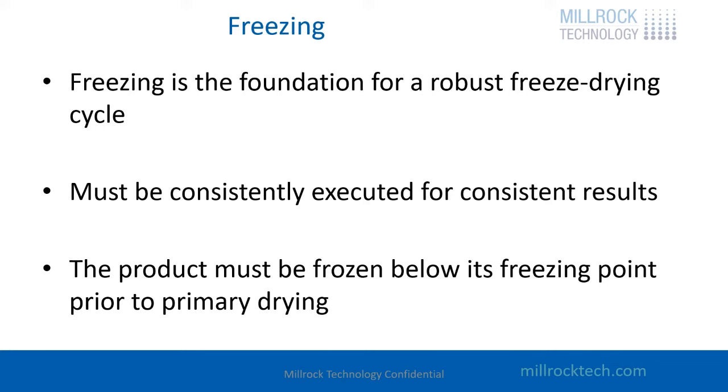Freezing is the foundation for a robust freeze-drying cycle. It must be performed consistently to get consistent results in the freeze-drying process. The product must be frozen below its freezing point prior to primary drying. If it's not, it's going to cause problems with the process.